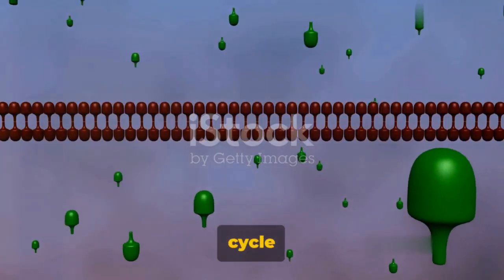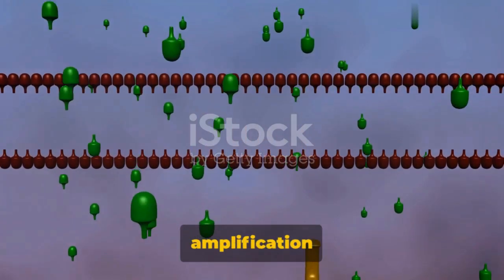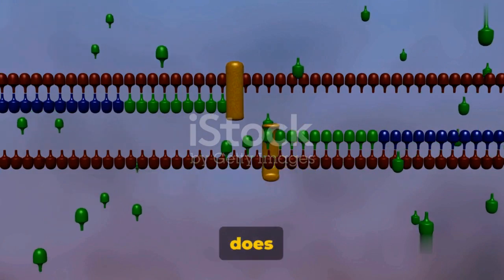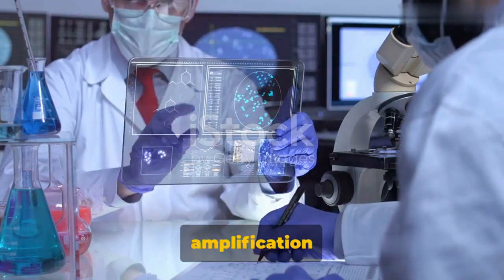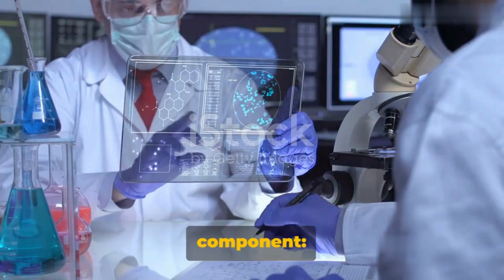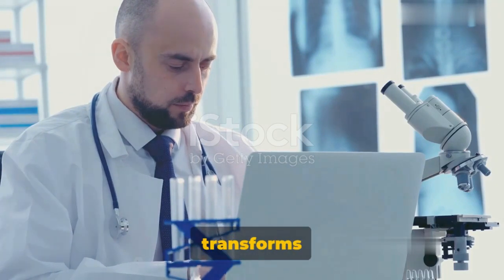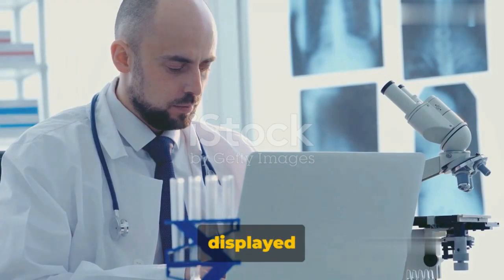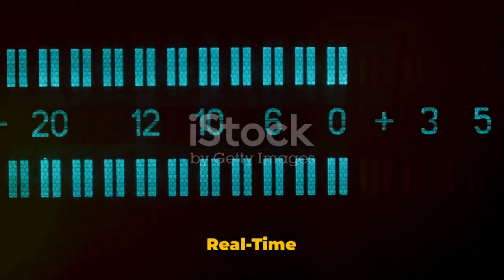And as the thermal cycle progresses, the DNA in our sample begins to multiply. This is the amplification step we discussed earlier. As the number of DNA copies increase, so does the fluorescence. The result, the signal is amplified along with the amplification of the DNA. This emitted signal is then detected by a very special component, the detector. The detector captures the glowing signal and transforms it into digital data. This data is then sent to a computer where it is displayed on a screen. It's like watching the DNA amplify in real time, hence the name real-time PCR.